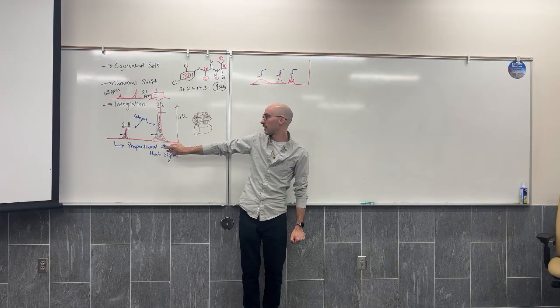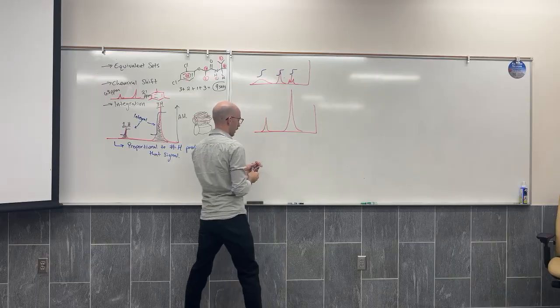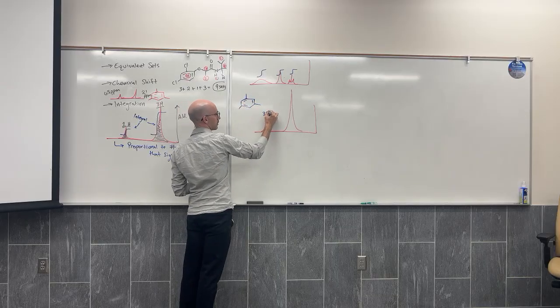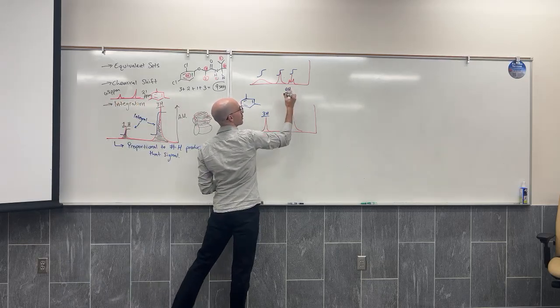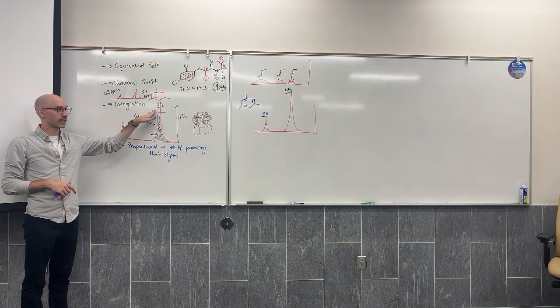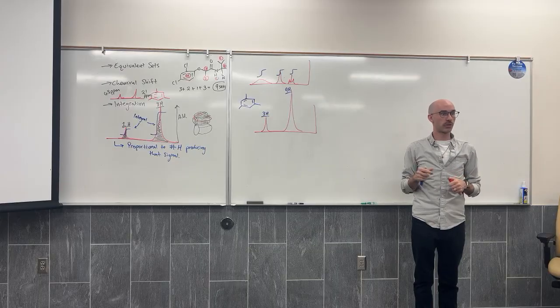Okay, so returning back to this, the best integration would not have been 1H and 3H, because we know the molecule that we're looking at has 3 aromatic hydrogens and has 9 methyl group hydrogens. So the best integration for 1,3,5-trimethylbenzene, although it normalized at 1H to 3H, is actually 3 to 9, which is proportional. Those are just proportions of each other.